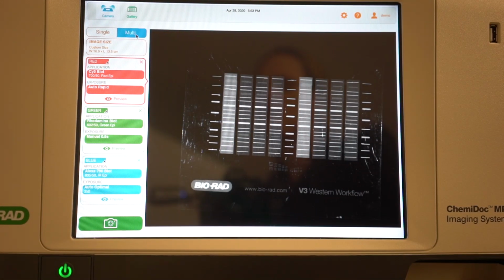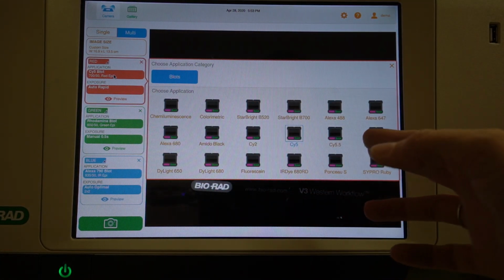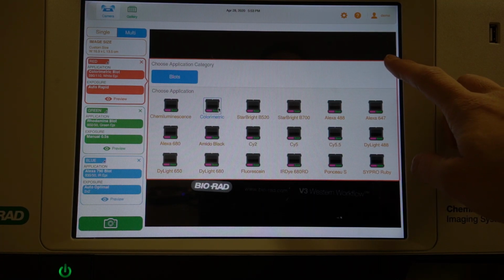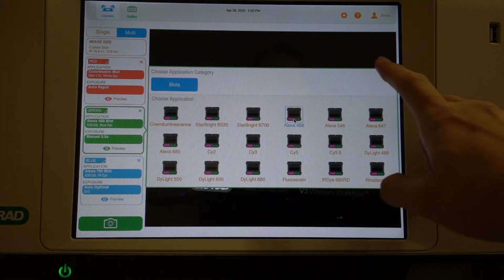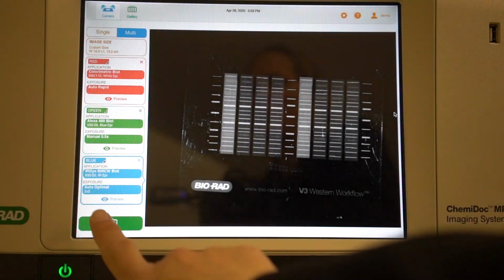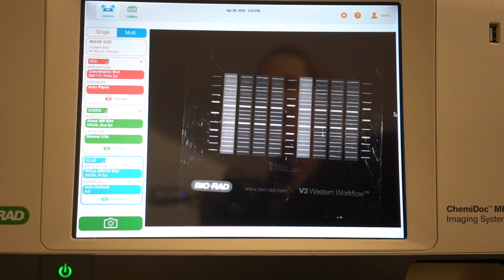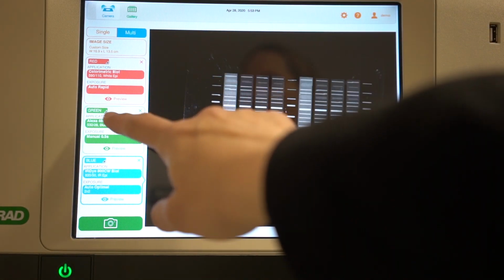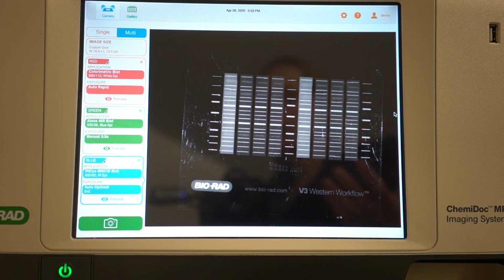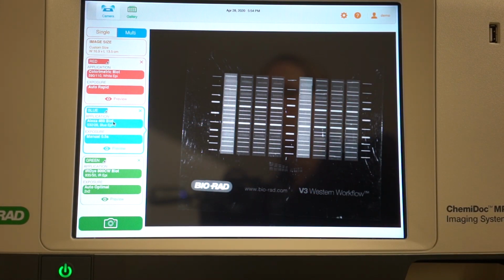I'll show you quickly the multi. So what this does is it allows you to multiplex, and what you do is you just go through and choose which application you're doing and your different fluorescents. And then once you go to take a picture, it'll take each one sequentially, and then it'll also have an overlaid merged image of those files. And these colors, these red, green, and blue, are what we call pseudo colors. It's just random colors that we chose. You can always change these to be something else.